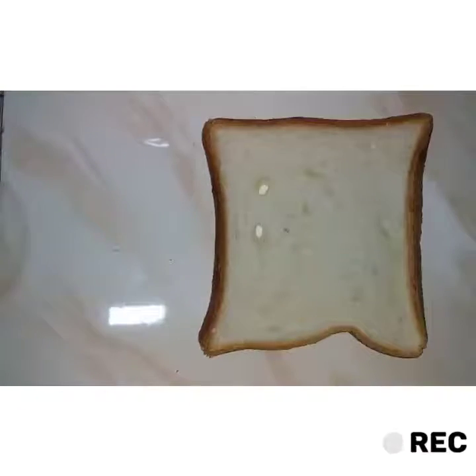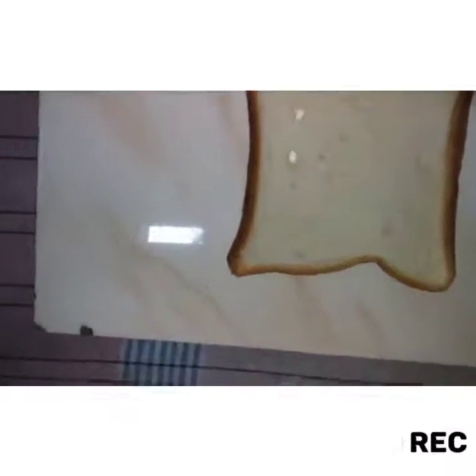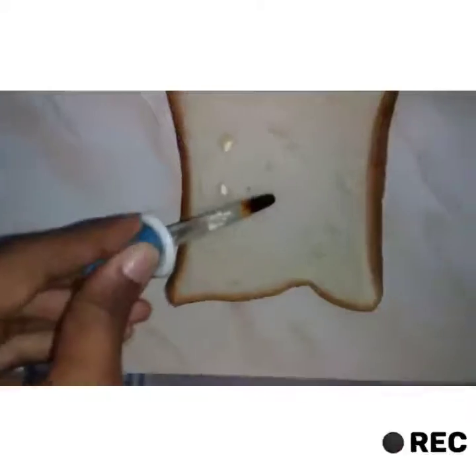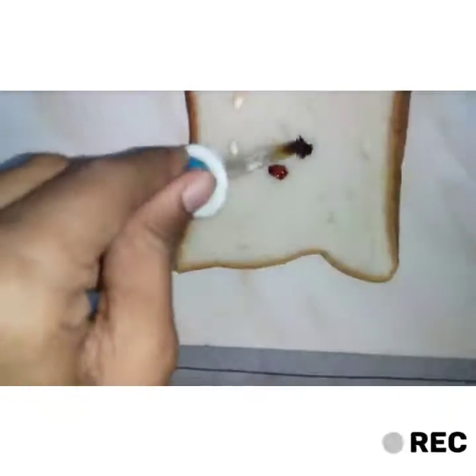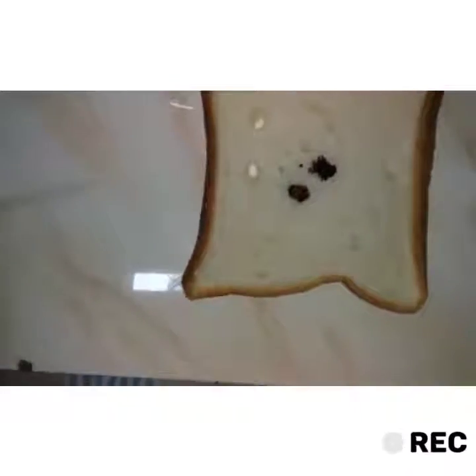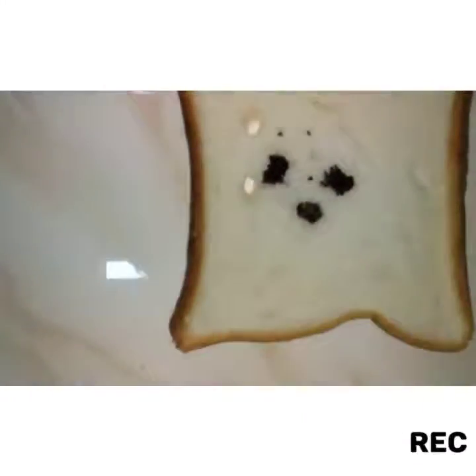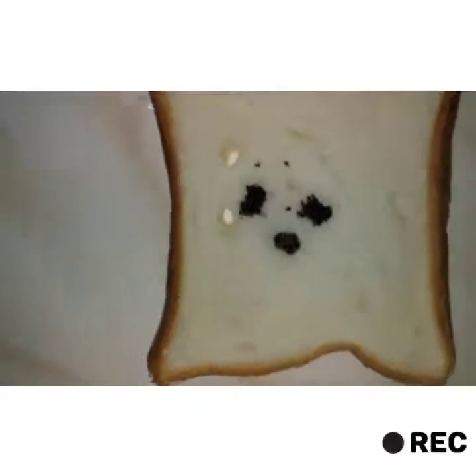Then we'll add the iodine solution to the bread using the dropper. You can see that the color has changed.